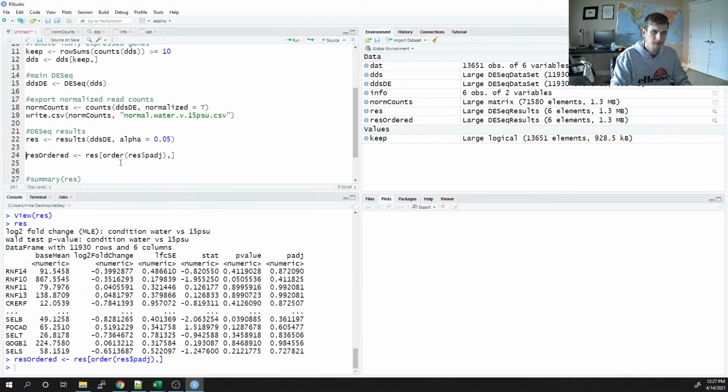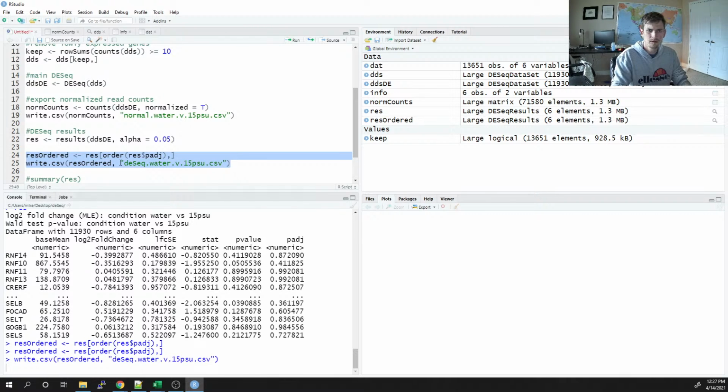And I'm going to write that out. Okay, make sure all those are there.